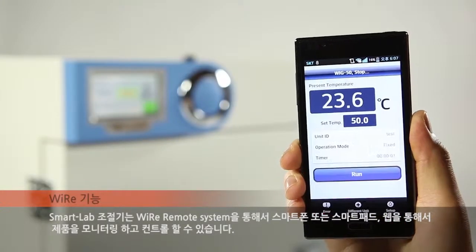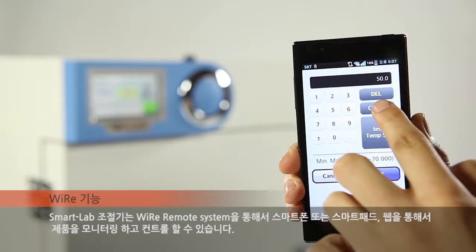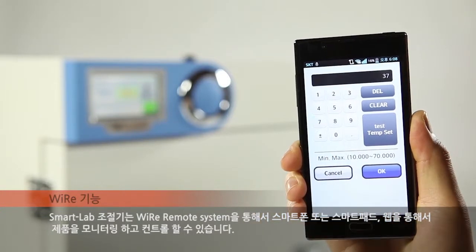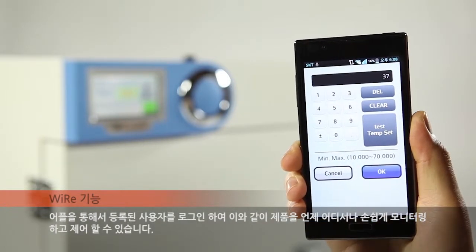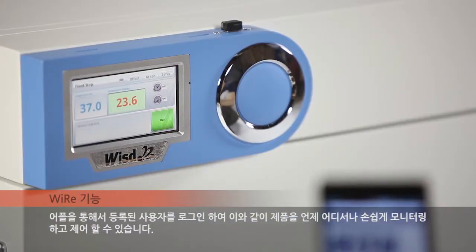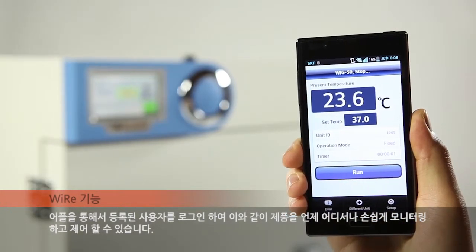Smart lab equipment can be monitored and controlled through a wireless remote system using a smartphone, tablet, or the web on your PC. Users who signed up on the app can log on to monitor and control the unit easily at any time and from anywhere.